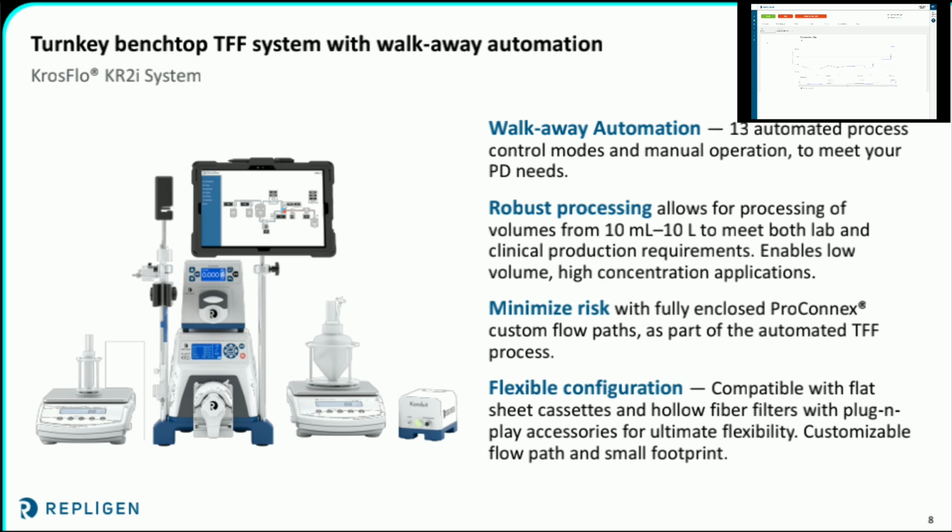It is designed to be, as I mentioned, the semi-automated system. One of the big control factors is an automated back pressure valve, which helps control your TMP automatically. And a lot of that is all controlled through the tablet listed in the center there.